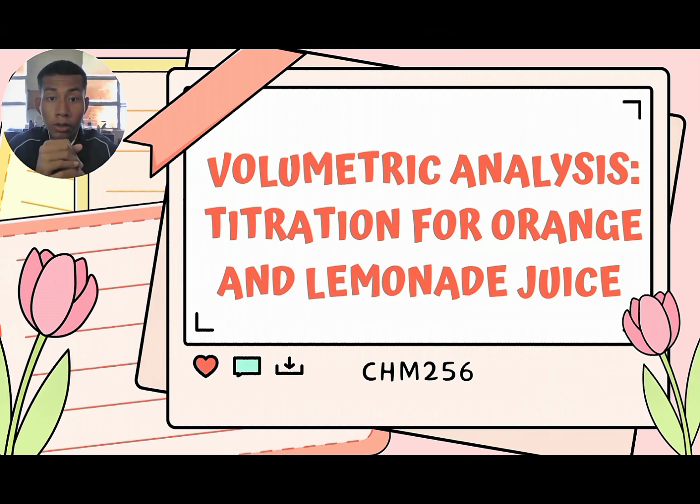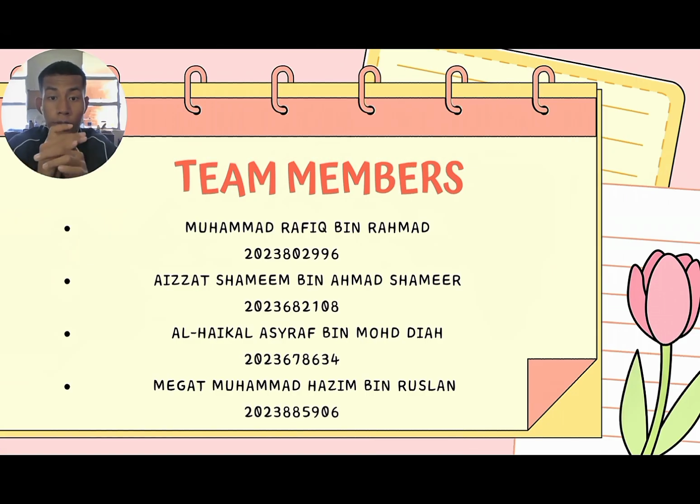Okay, so today our group are going to present about volumetric analysis, which is titration for orange and lemonade juice. So my name is Aizat Shamim bin Ahmad Shamim. I'm from group 8. Okay, so next in the first slide we have our team members.